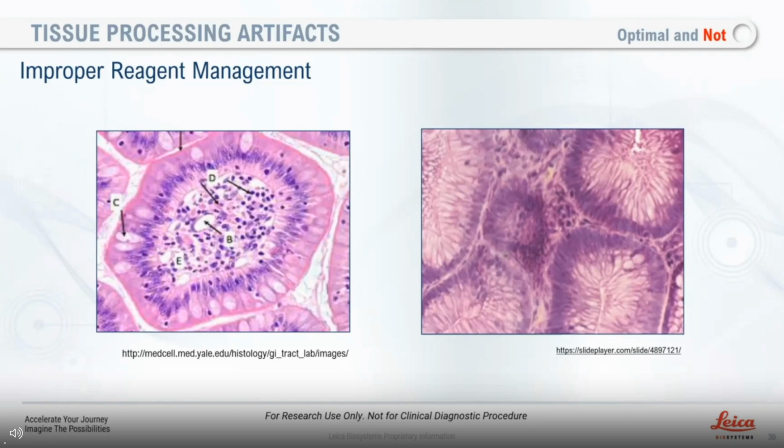That's the number one issue that I see in the field, and that I'm having to talk to people about, is not only fresh reagents, but having a regular schedule. How often you change reagents depends on the volume of tissue that you're processing.